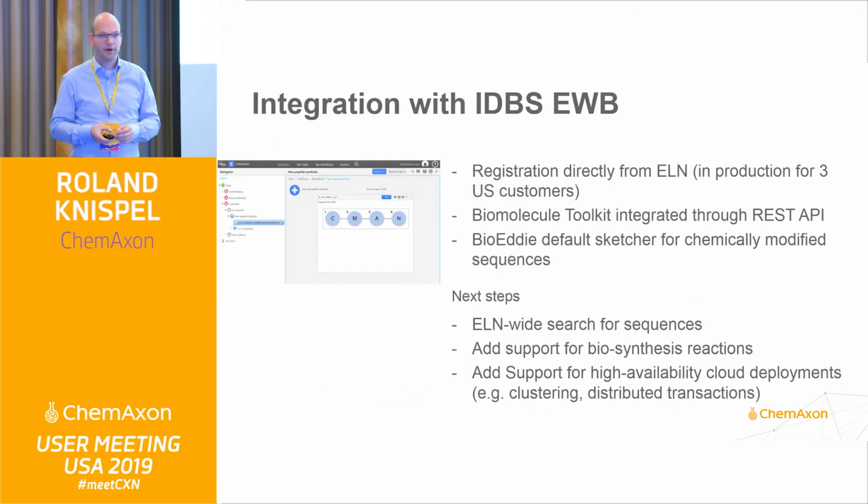The last part is something that comes from the angle of where people are usually capturing their day-to-day activities within an electronic lab notebook. Here we are working especially close at this moment with IDBS.